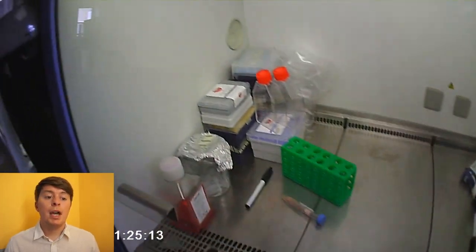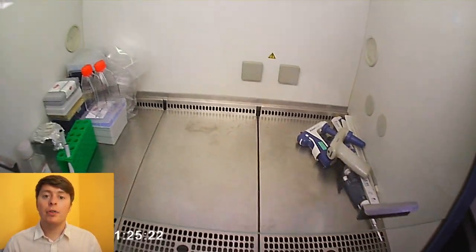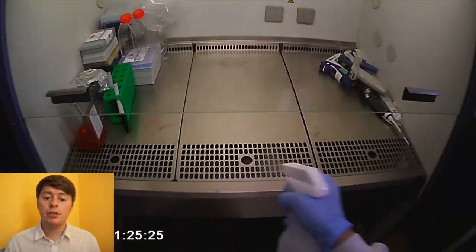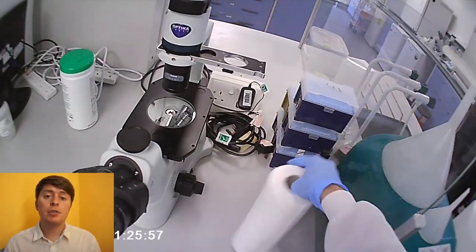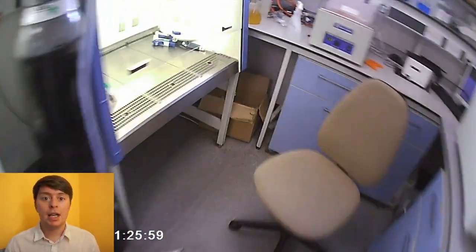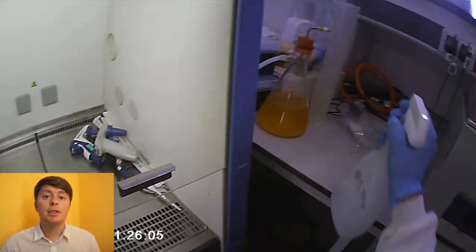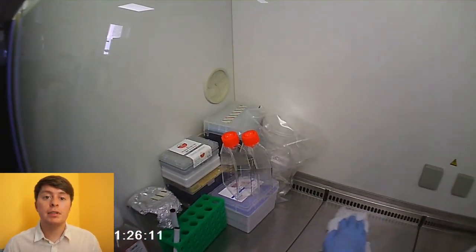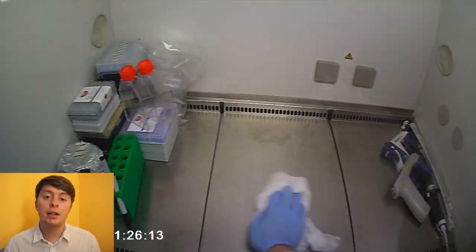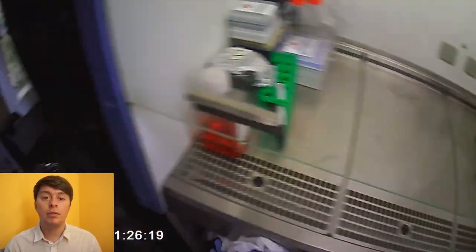So now, just tidying up, every time that we are done in the hood, we want to spray everything and make sure the lids are screwed tight. Give a brief spray on the automatic stripette we may use, get rid of any spare stripettes that we have from the cell culture hood, and just make sure it's in a nice tidy presentable manner so that other people can use it. Notice this technique where I start at the back and move forward. That's because I don't want to reach over a part that I've already rubbed and introduced bacteria. I just want to use that paper towel to move the IMS across that surface, working from the back to the front without introducing any bacteria or contamination within that cell culture hood.